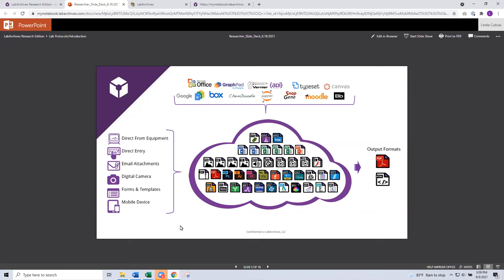Now let's start talking about the notebook itself. When you first create your account, your notebooks are going to be empty. It's going to be up to you to populate and organize that data — those are really some of our main topics for today. You can get data into your notebook through what we call our entry types. We support a variety of different entry types, such as direct entry, email attachments, document uploads, and mobile device support.